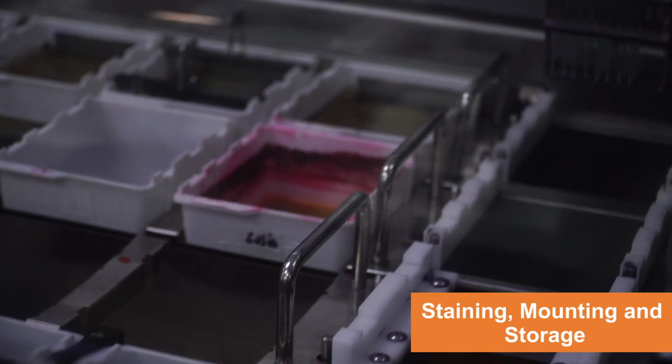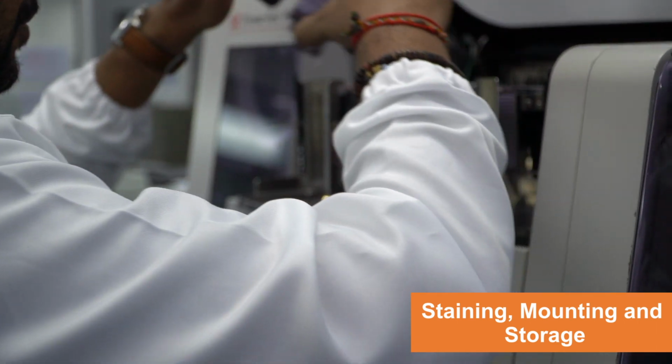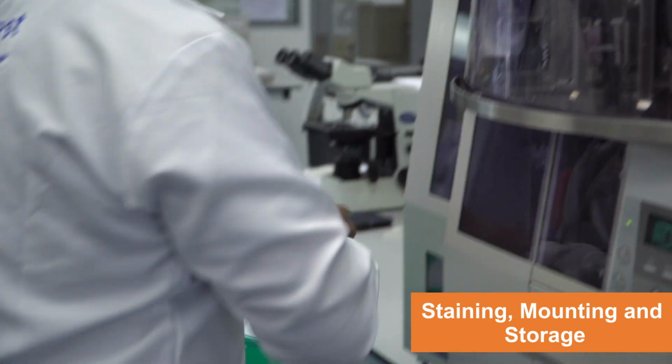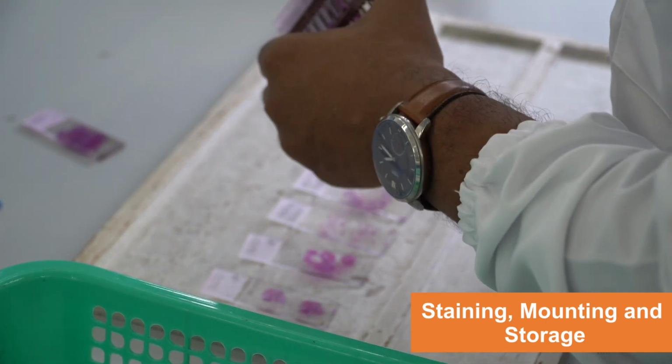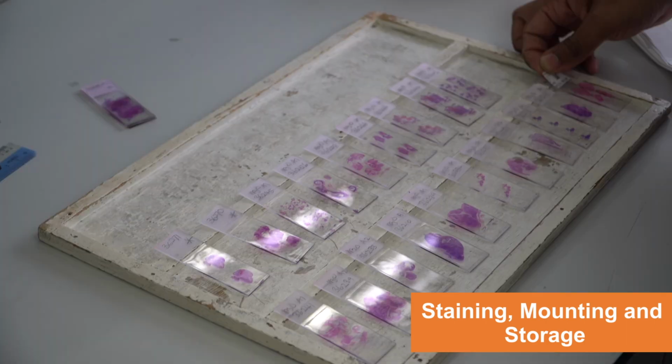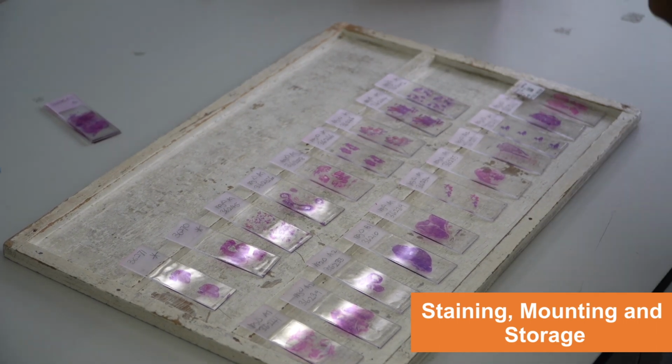Following staining, proper mounting is crucial for preservation and long-term storage, ensuring stained tissues remain intact and accessible. This involves applying a transparent mounting medium to eliminate air gaps and preserve optical clarity. Proper slide storage, with clearly labeled racks, facilitates easy access for future examination and analysis.